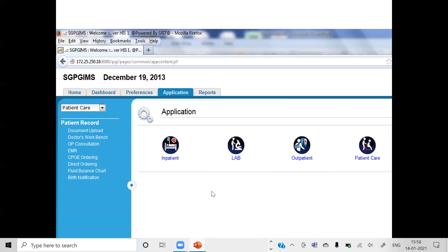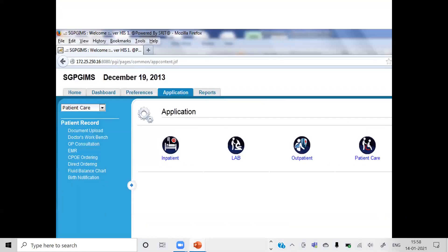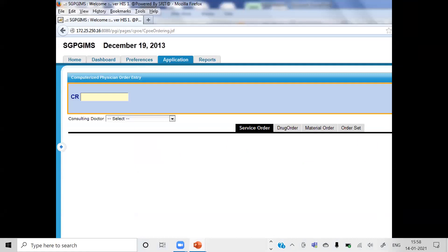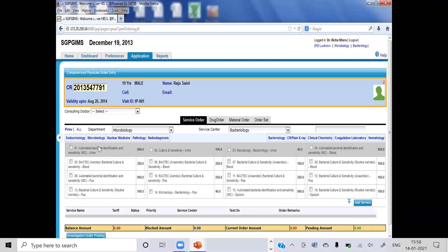CPOE stands for Computerized Physician Order Entry. Through this window, for the microbiology part, you select 'Laboratory.' You then go to the department and select whether it is microbiology, pathology, radiology, or nuclear medicine — go to the service center and take a drop-down. In bacteriology there are multiple tests, so you have to understand what are the automated tests and which ones are the routine tests.